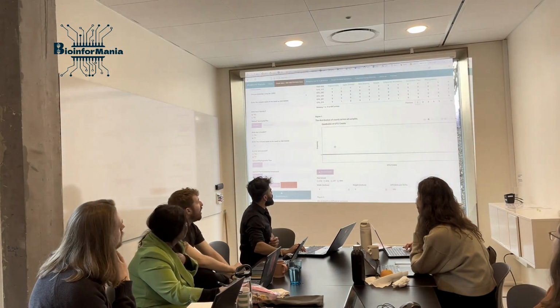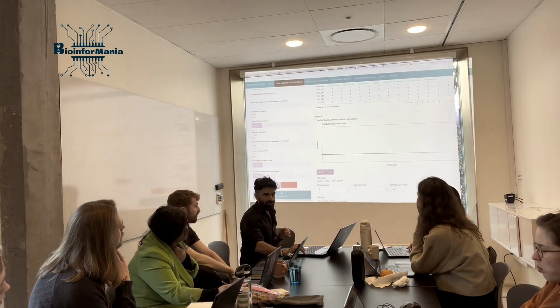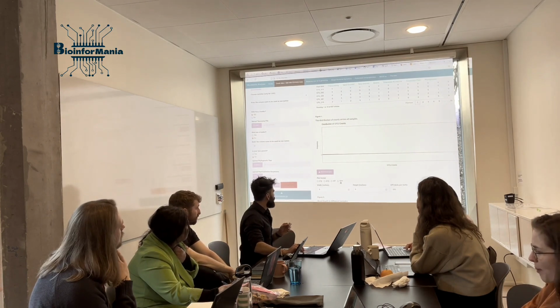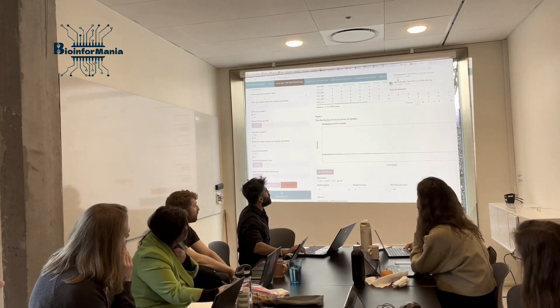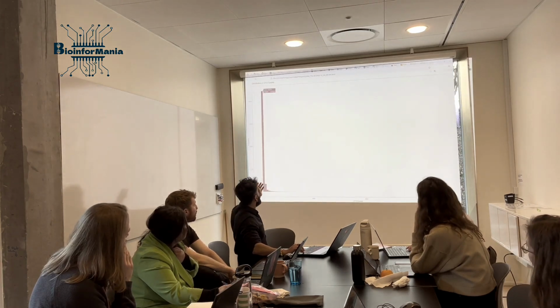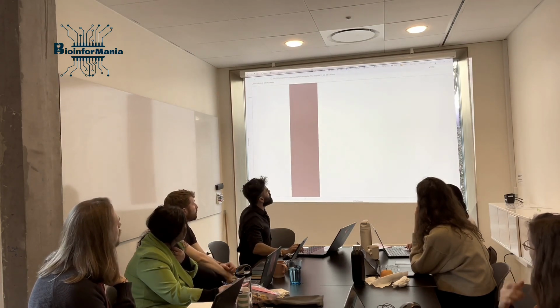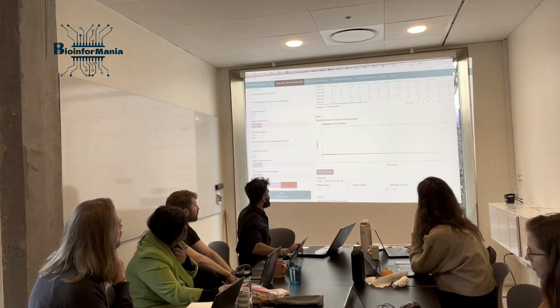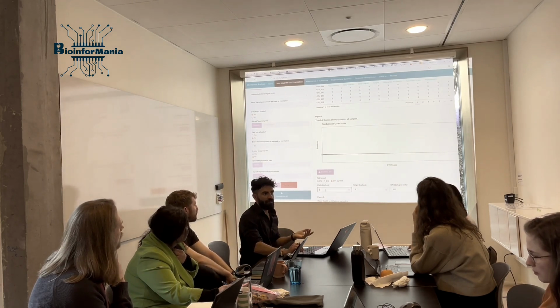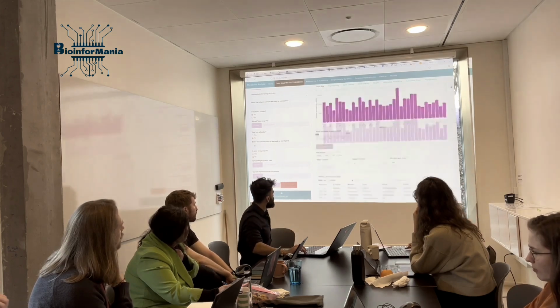I want to say something, and I don't want to touch upon again. You can download these plots at any format and any quality and any dimensions. If you want to have it as interactive as this is, you just click HTML, open HTML, and then you have the responsive plot like this for demonstration purposes and presentations. You can also download it as PDF, JPEG, or PNG. You can also decide on the dimensions, whichever dimensions, whichever quality you can desire for your publication.